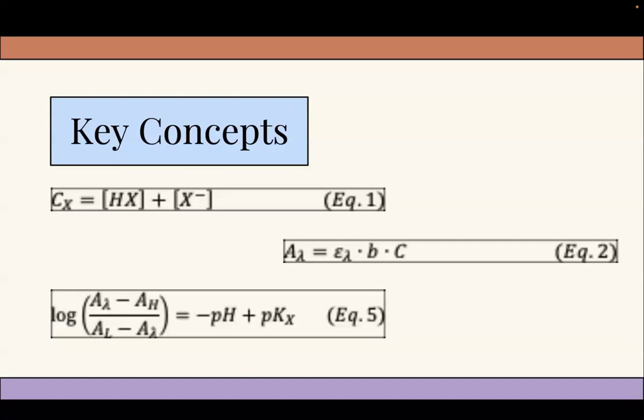This is Beer's law, and it states that the absorbance of a solution is directly proportional to the concentration of the absorbing substance, the path length of the light through the sample, and the molar absorptivity of the substance. This equation is foundational in spectrophotometry, allowing scientists to quantitatively measure the concentration of a substance in solution based on its absorbance of light.